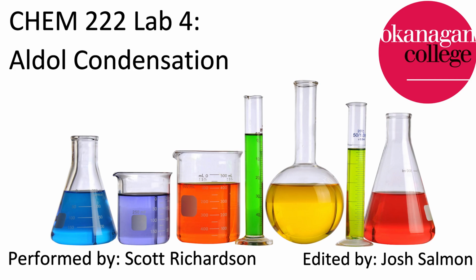As explained in the lab manual, both of the starting materials have very low melting points, and as a result, they act as co-impurities, and upon mixing, without any solvent, they liquefy. The addition of a catalytic amount of sodium hydroxide causes the nucleophile to become charged, reacting with the electrophile, producing a large molecule that has a high melting point. Once this forms, we get solidification, and then we isolate through use of a centrifuge and then recrystallization.